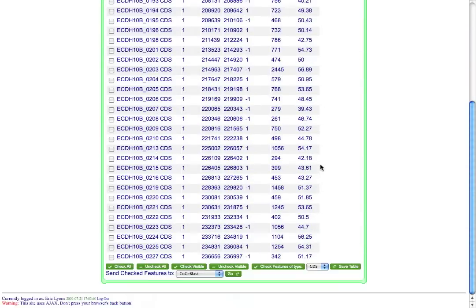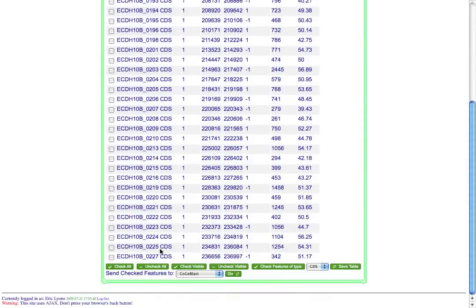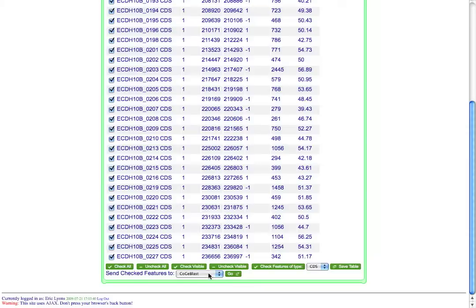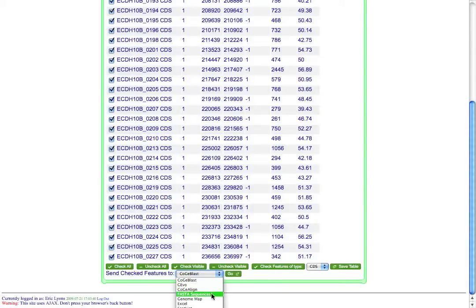And then what I can do is I can go ahead and send these over to a variety of different Koji tools. So if I was interested in searching another genome with all of these features, I could send them over to Koji Blast, which is Koji's tool that lets you search any genome within the system. I could send them over to Jivo for doing genomic analysis. I could align the sequences.